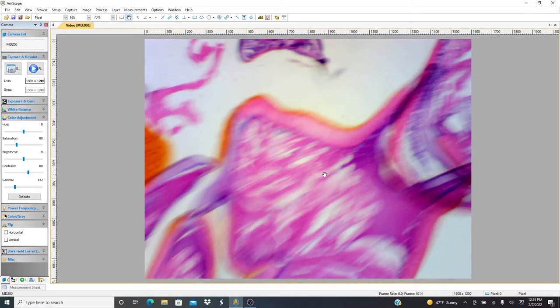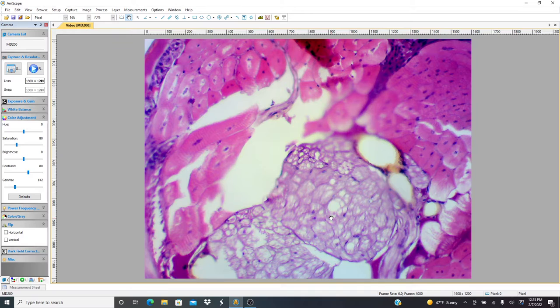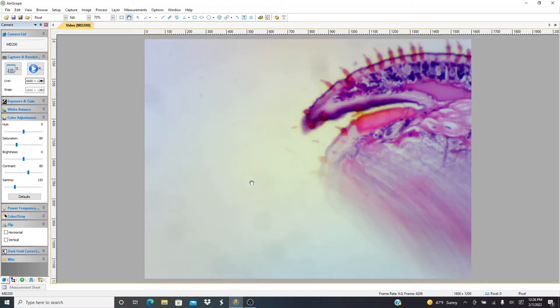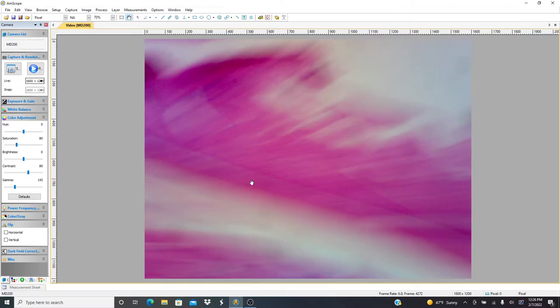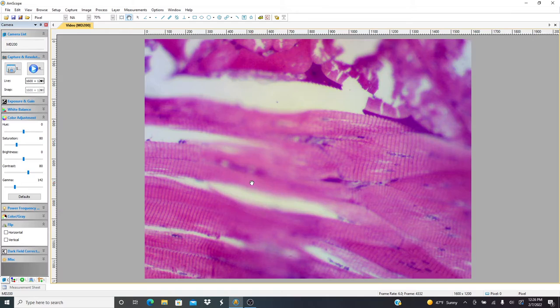Head back to the head. Yeah, this is the head right here, best as I could tell. This tissue right here. I don't have any idea what the nervous system of these things is composed of, or whether they have brains in their head or not. It does not look like human brain tissue. Another thing to note, I'm not seeing any evidence of a circulatory system or a peripheral vascular system. Expert bug people will probably laugh at me and say, well, obviously these things don't have a cardiovascular system, and that may be true, but I just don't know that. I never studied these things. I don't see any cross sections of blood vessels or anything.